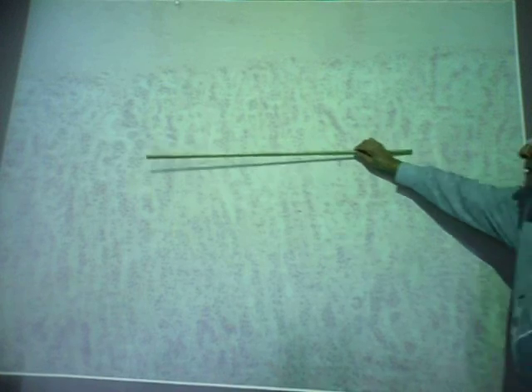Okay, the cortex of the adrenal gland is divided into three regions. The outer region, adjacent to the capsule, is this region. Here, the cells are arranged in little clusters, kind of spherical to oval.